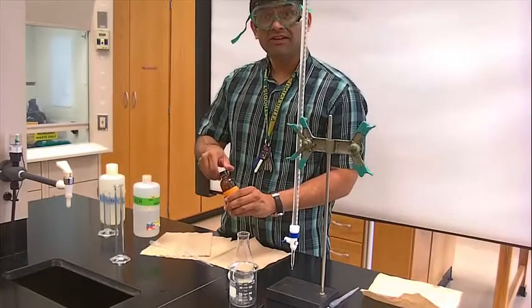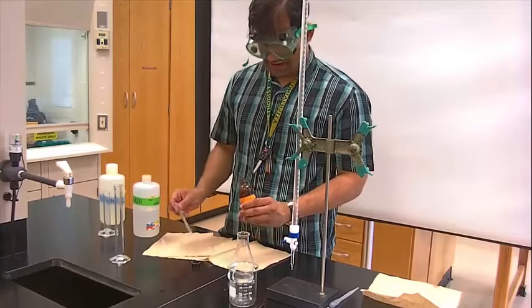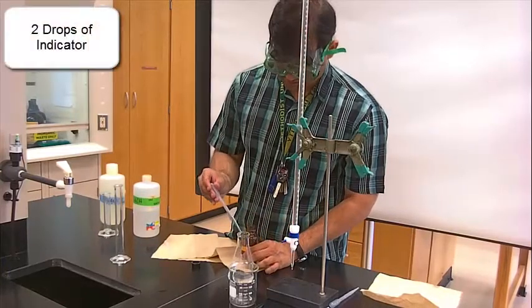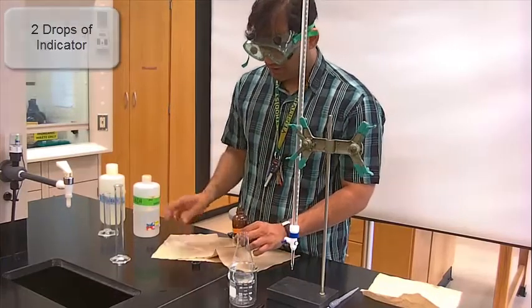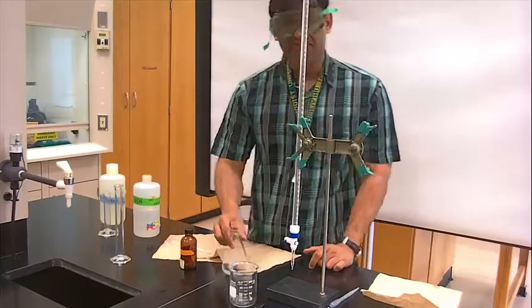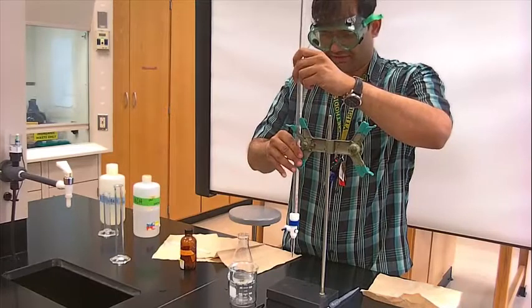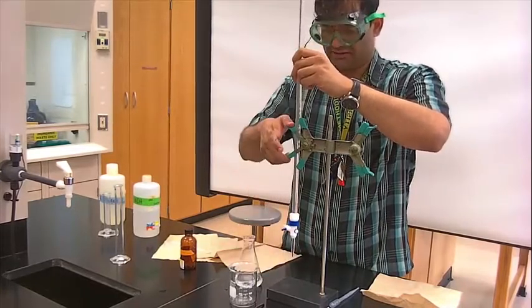The next thing you want to do in your titration is put your indicator, okay? And our indicator here is going to be phenolphthalein. So the phenolphthalein is our indicator. Just want 2 drops here. 1, 2. Okay, so you don't have to go overboard on the phenolphthalein. It is sensitive enough. And now I have my vinegar with water, and we're ready to proceed with the titration. Let me just push this a little bit up here. And this is where you and your partner are going to have to do some maneuverability.